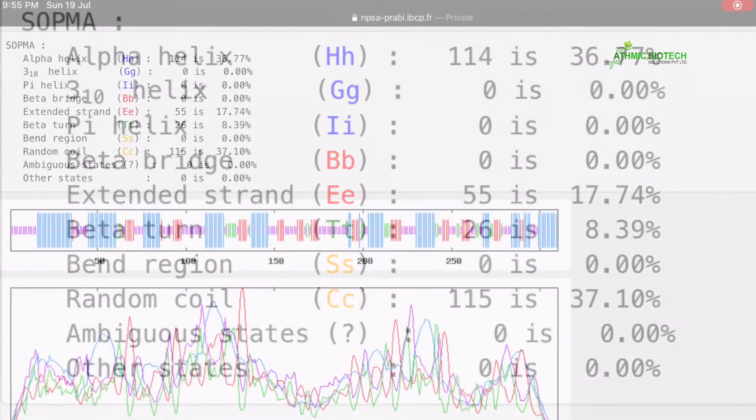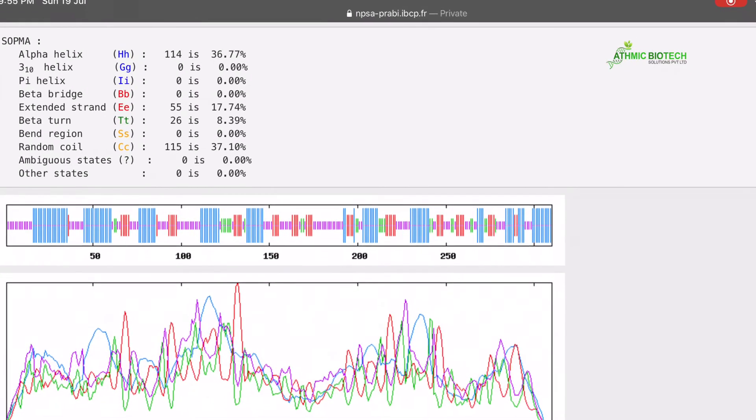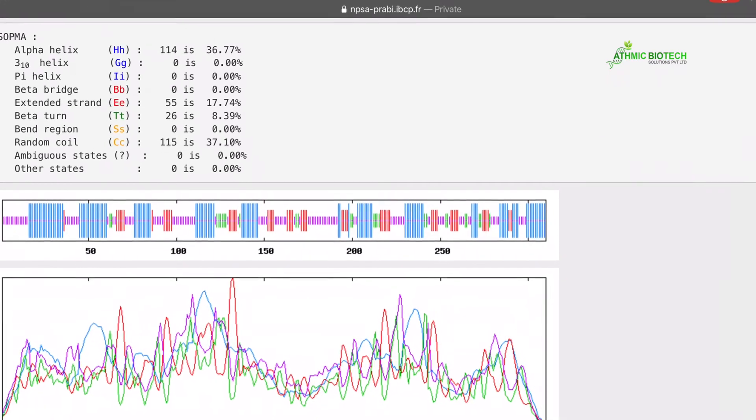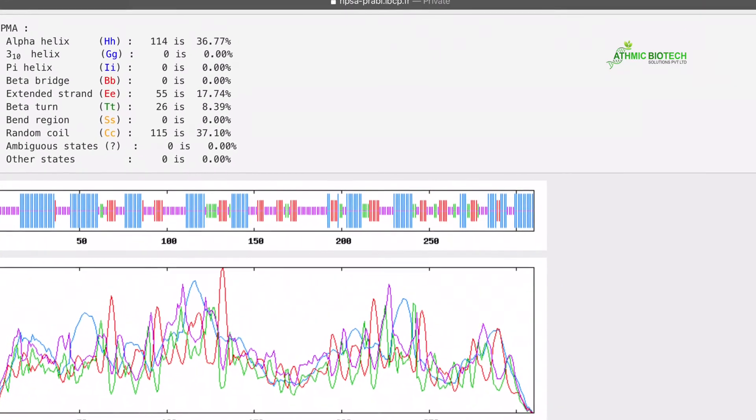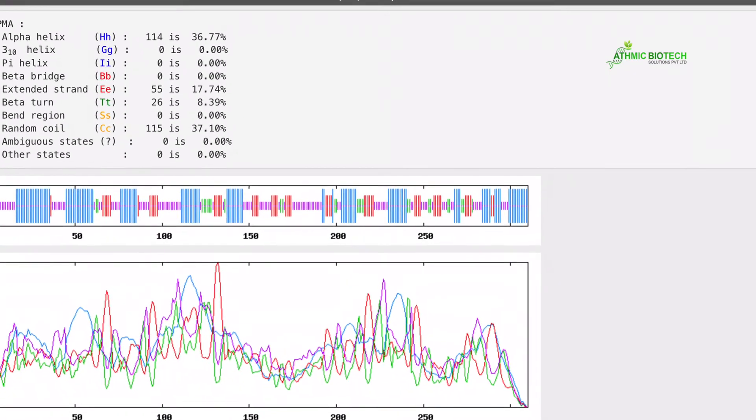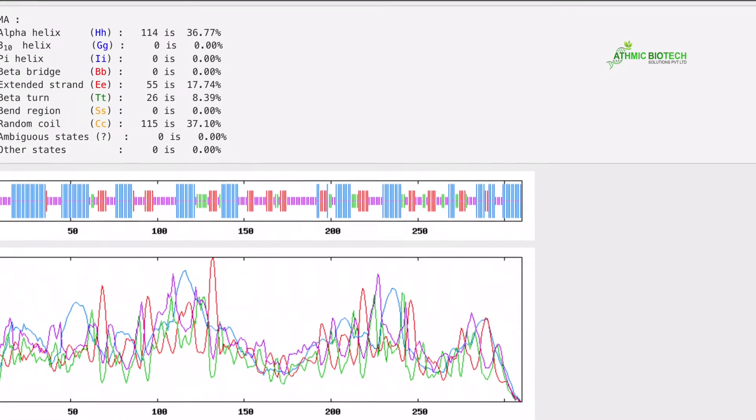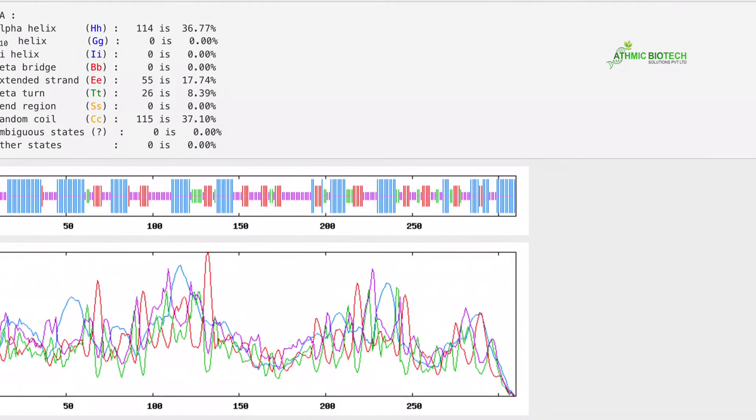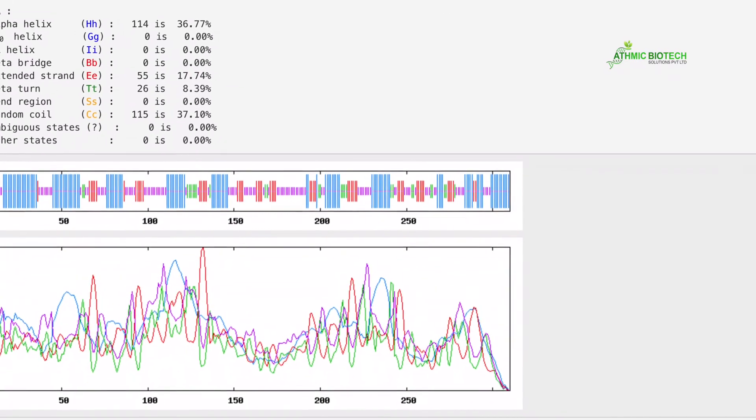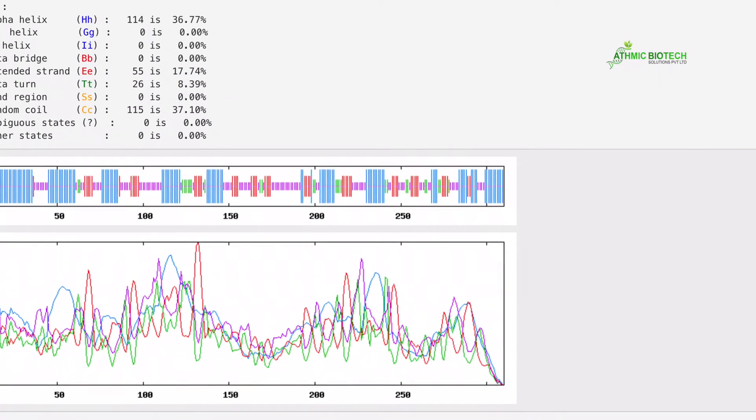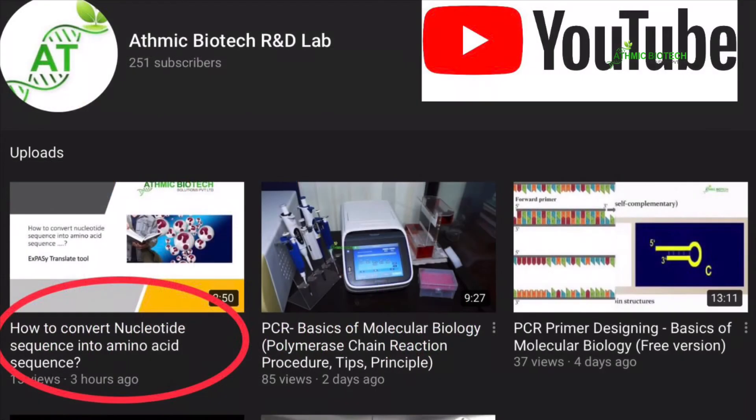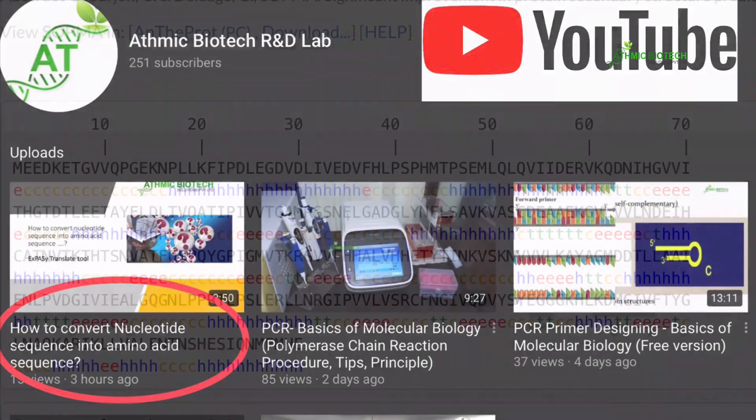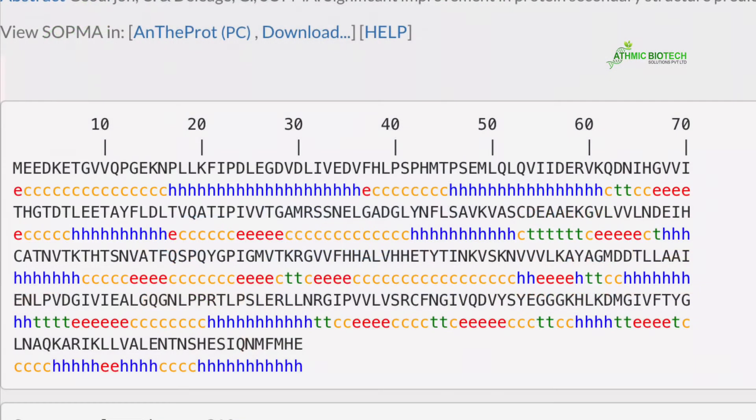So these are online tools. If you go to the encoding sequence, you can translate it into amino acid. Then you have predicted its secondary structure. These are all online tools which are free.